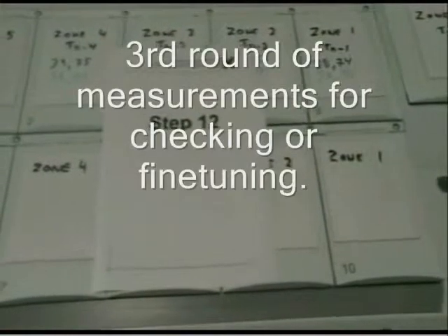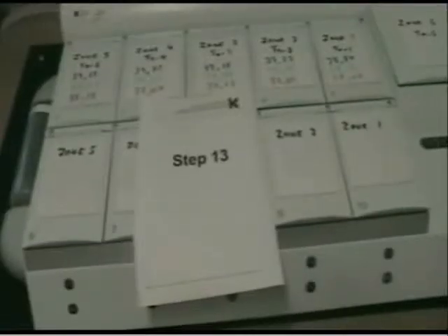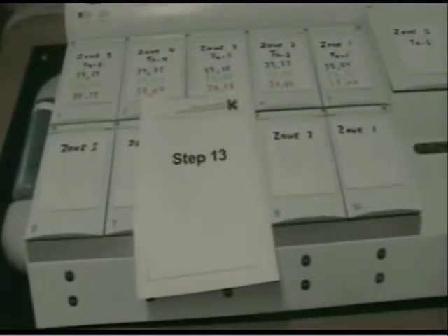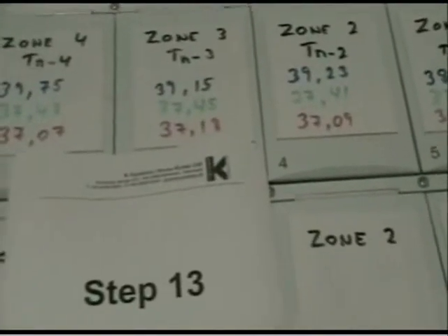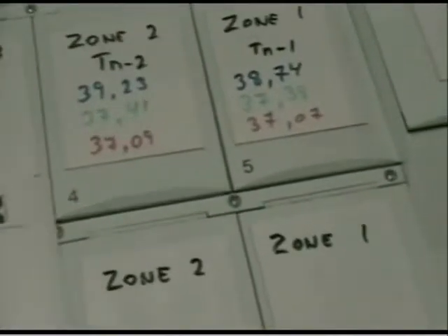We are going to do a third iteration of the measurements to make sure that we achieve the desired result, possibly making some small adjustments. The results show 37.18 in zone 5, 37.07 in zone 4, 37.18 in zone 3, 37.09 in zone 2, and 37.07 in zone 1. So I would adjust just a bit here.